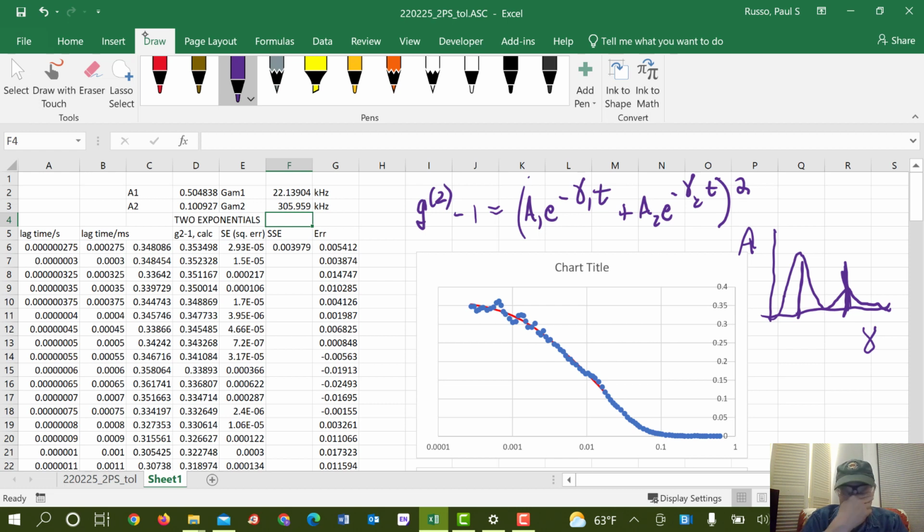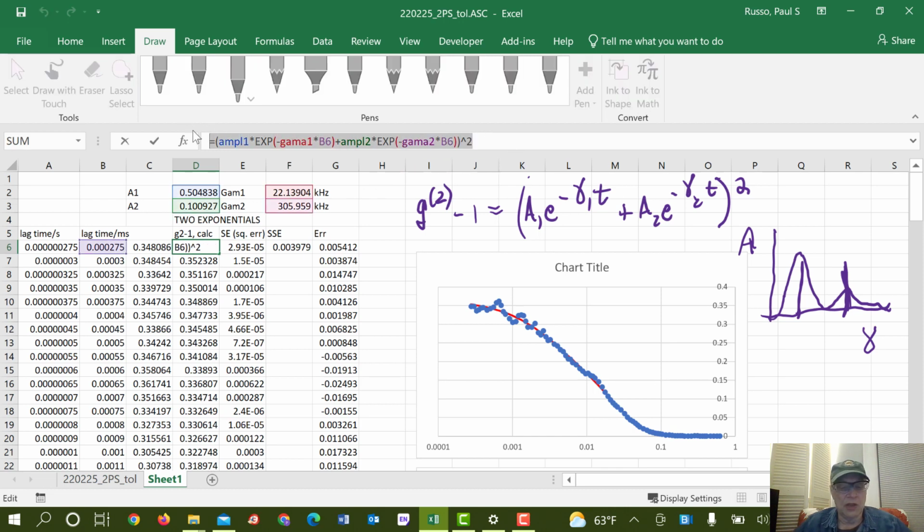Now, we could, if we wanted to, see how well this would fit a single exponential. That would be a matter of going here. I'm going to save this text so that I can put it back later when I want it. I'm going to put it in Q1, for that column Q. I'm not going to say equals Q1, for heaven's sakes.